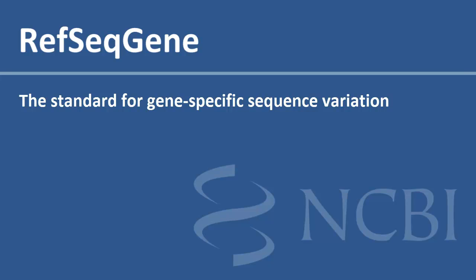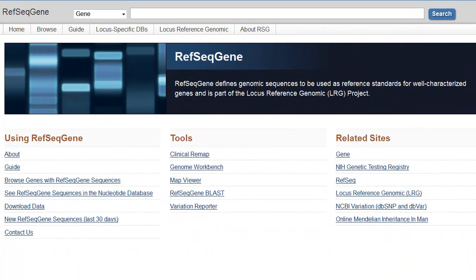This video provides an overview of RefSeqGene, the standard for reporting gene-specific sequence variation. I'll review RefSeqGene's homepage, show how to find a RefSeqGene sequence for a specific gene, and then show how to display a variation in multiple RefSeq coordinate systems.